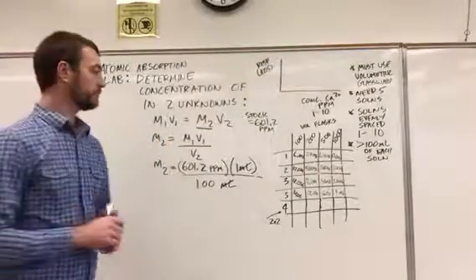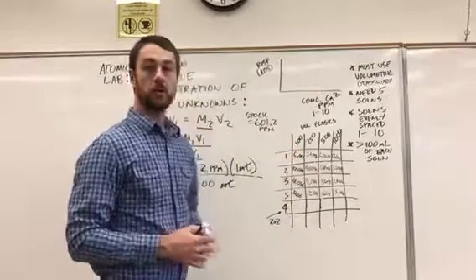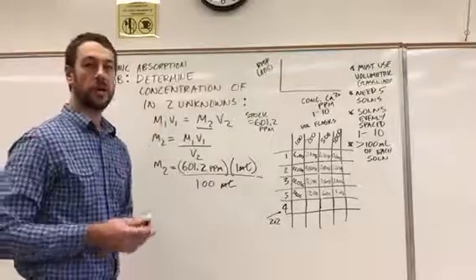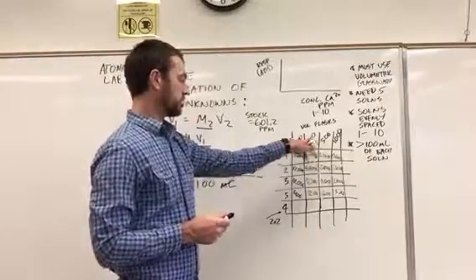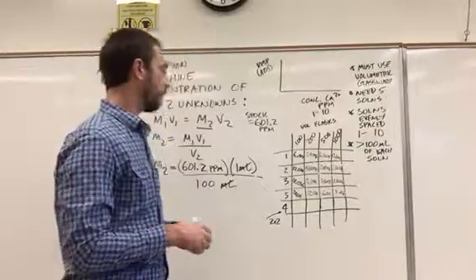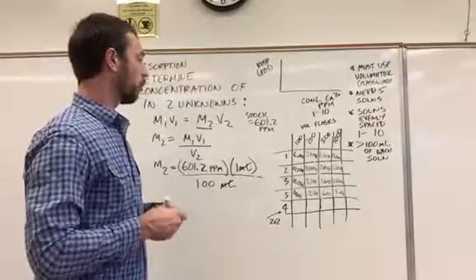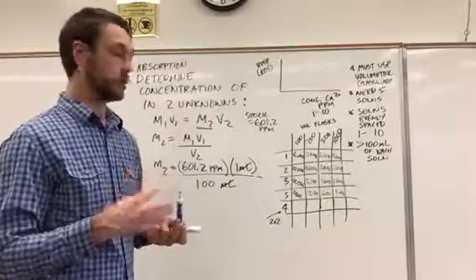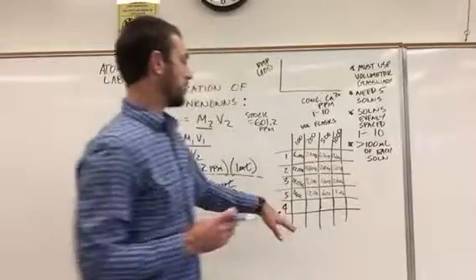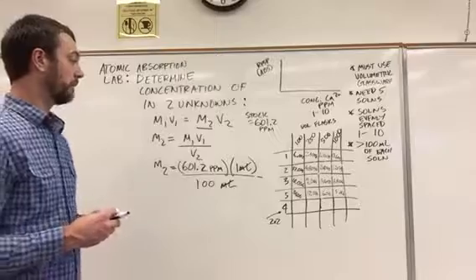Okay, welcome back. So I filled out the table with all the selections using this same M1 V1 calculation for all the combinations of these flasks and pipette volumes. Okay? So I want to point out a couple things. One is that we only need 5 solutions, okay? And obviously here there's 16 different selections, so we're not going to use all of these, okay?